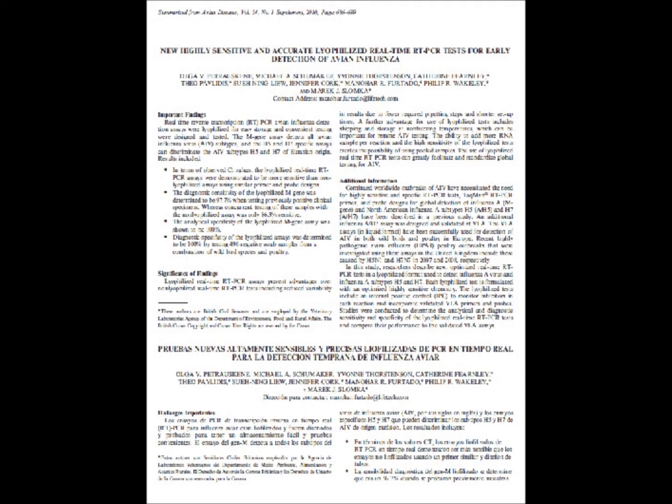Well, Dr. Furtado, you recently participated in a fascinating study on the assay trials of a RT-PCR lyophilized test. Can you review that for our audience? Yeah, so when I was at Life Technologies, we were generating lyophilized tests for detection of a large number of food pathogens and also for influenza.